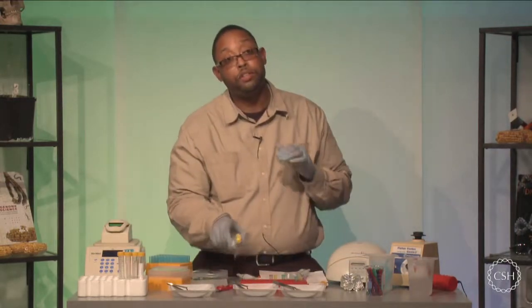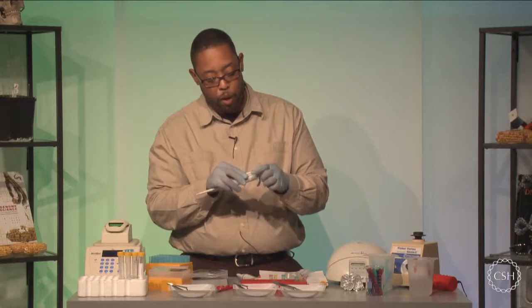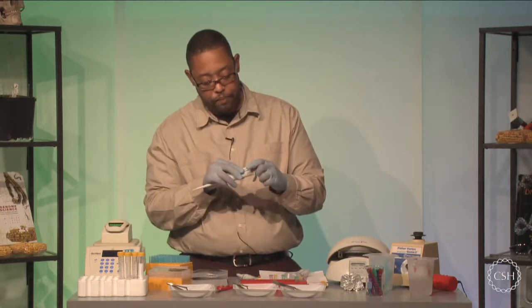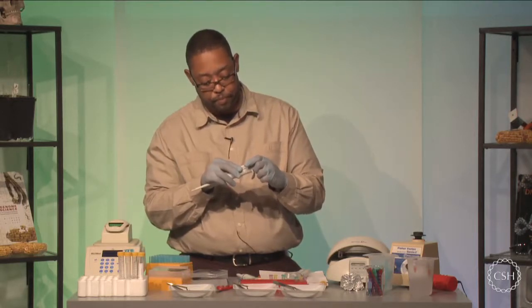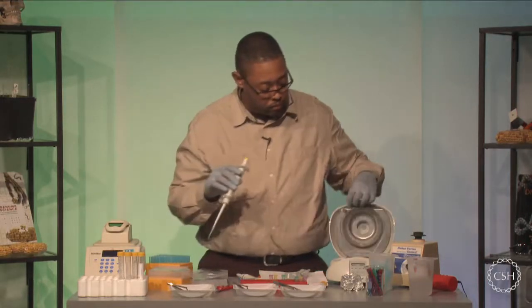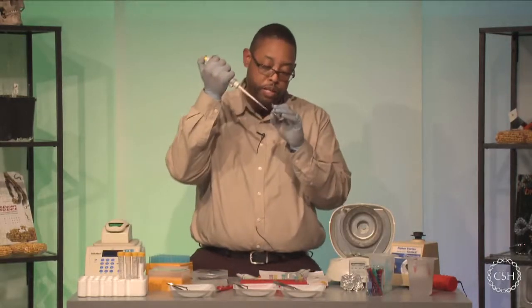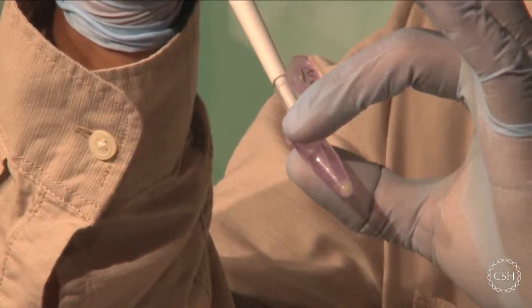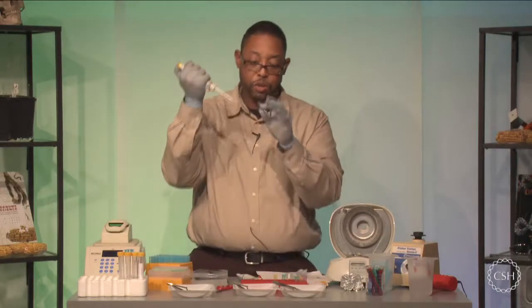Now, although we put 100 microliters of fluid in there, to ensure that we don't pull any of the silica resin over, I'm going to say dial your pipetter down to about 90 microliters so that we only pull up 90% of the actual sample. This will make sure that we don't go into the pellet and draw up anything that could be potentially bad. So I'm going to take my sample number one and transfer that into a new test tube. Remember, you just want 90 microliters of the clear liquid. You don't want any of that contaminating material at the bottom. If you notice that you're starting to get some of that material coming up into your tip, avoid it at all costs, and transfer into a new fresh tube.